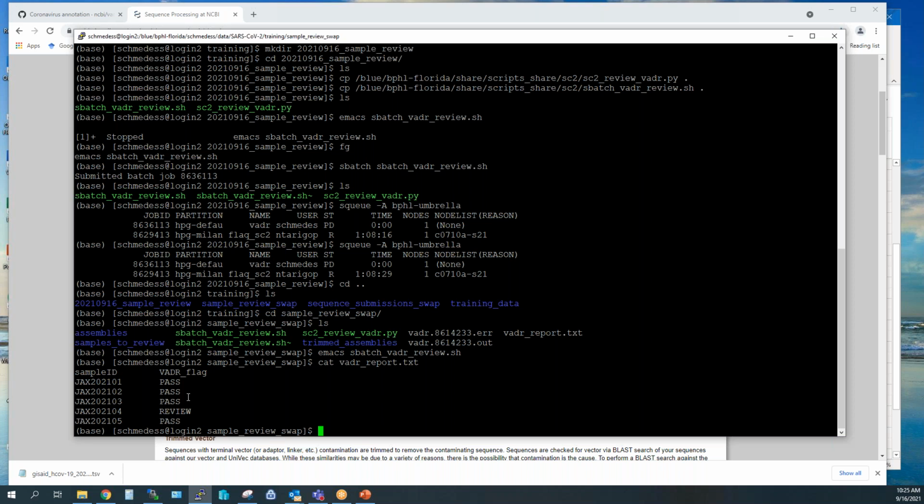So in order to get the most data in the databases as fast as you can, so that it's as useful to the public health community, we want to make sure that we batch our samples by only submitting, or prioritizing, I guess, the samples that pass our QC and then also pass Vader. Focus on those first, get those submitted as fast as you can, and then as you have time, you get more help. So I know some labs have the PHL genome specialists now to help with that, to go back through with their reviewed samples.